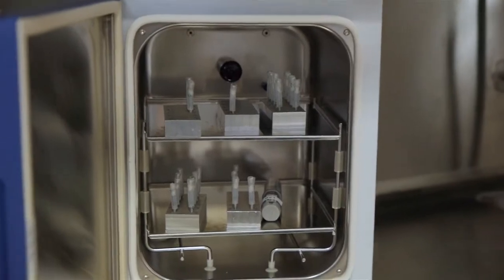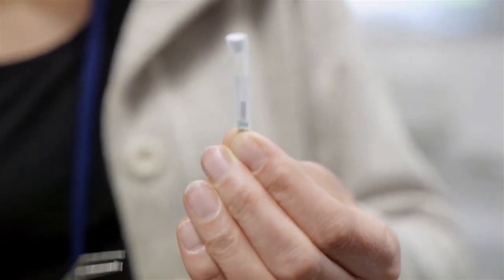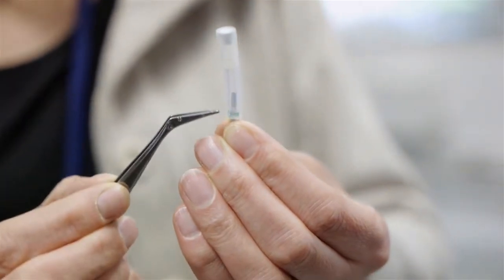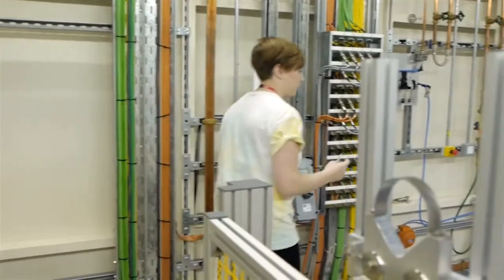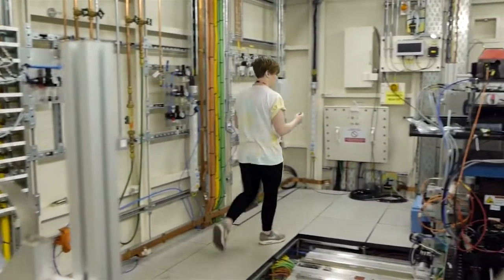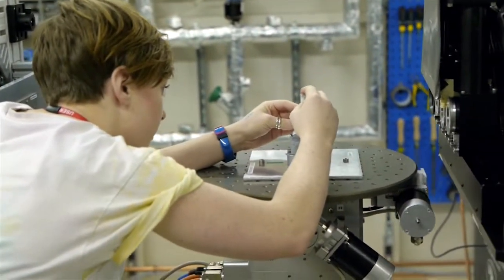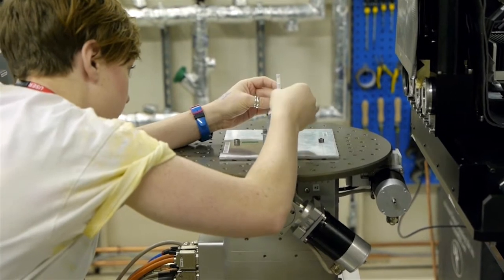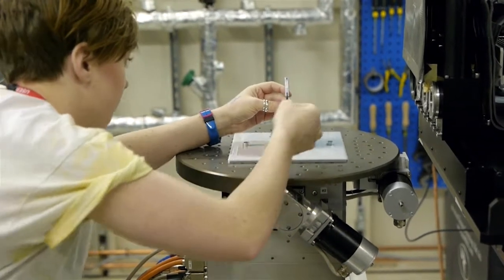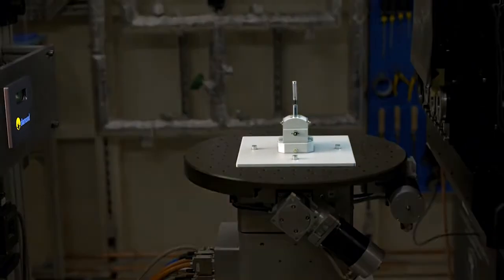We have little stainless steel pins and we slip a plastic tube over the outside which contains something to maintain the humidity. We can measure these kinds of pits using lab-based tomography, but the pit's actually growing during the measurement, so we can't do these kinds of time-dependent experiments. We just put our X-ray beam through.